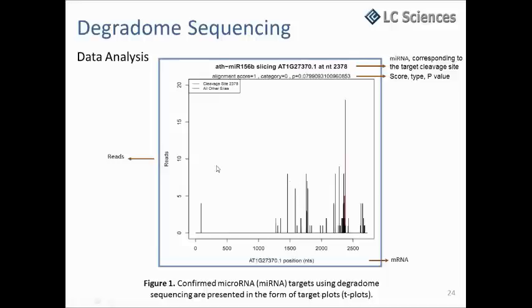to this. So, for example, for this read one, we get the raw reads of about 18, and the others we still identify as other cleavages on the messenger RNA side, but suppose we are not getting any microRNA pair to this. We didn't identify any microRNA for this cleavage site. Maybe they are coming from an unknown microRNA, or maybe they come from other cleavage happening to this messenger RNA.